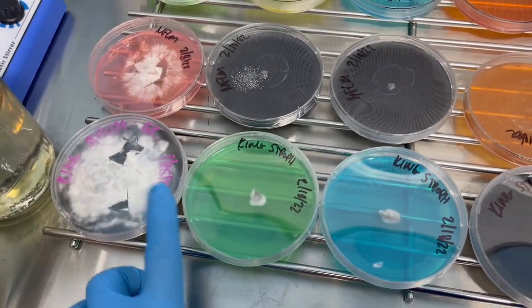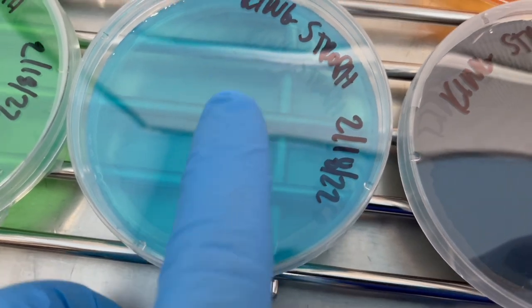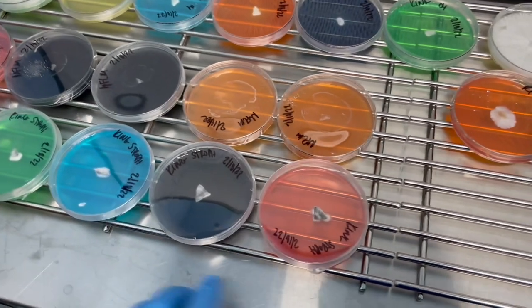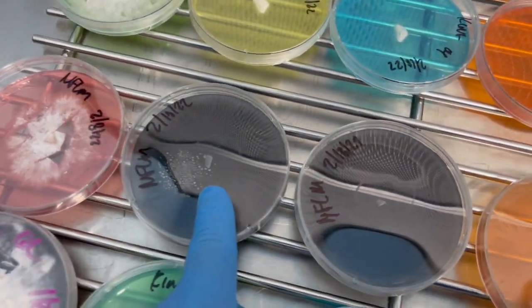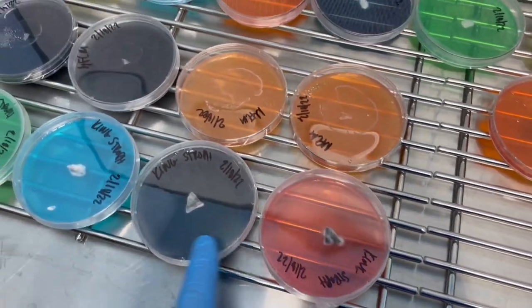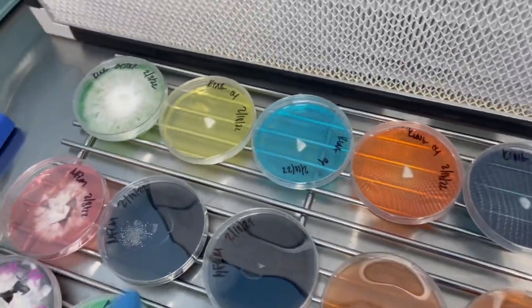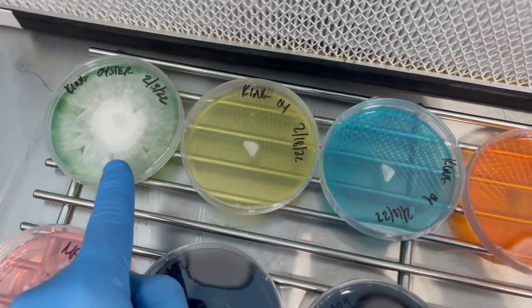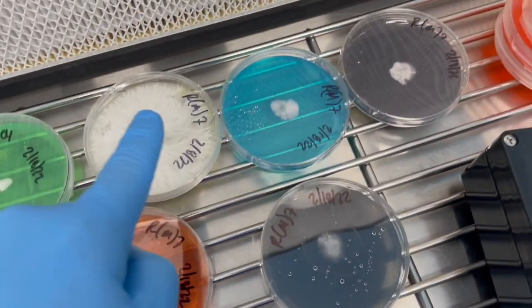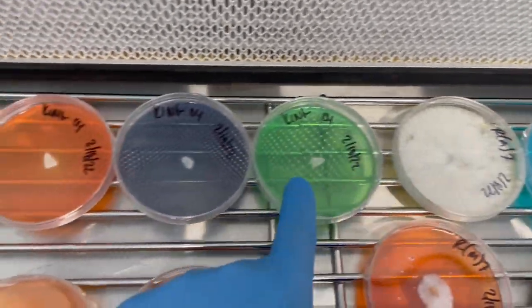Okay, so here are the King Stropharia wedges that we cut out, and this is what I was talking about earlier. You can see that this is where this wedge fell onto the petri dish, and then I moved it over, so that was just a technician error. But then if you look at the lion's mane wedges, you can see some spindly growth, not too much happening, but the fact that there's not this mycelium growing off of these wedges kind of proves that there wasn't any carryover. And then we'll look at our oyster mushrooms here, and you can see very clearly the same mycelium. And then if we come over to this rhizomorphic strain here, we're getting a lot of rhizomorphic mycelium that looks much different than the king oyster.